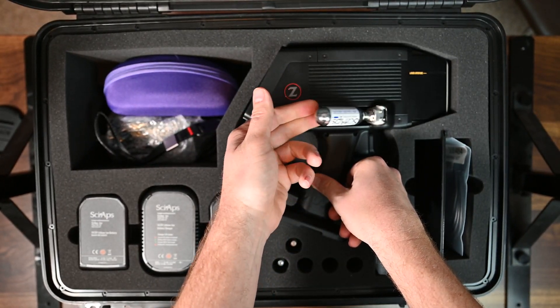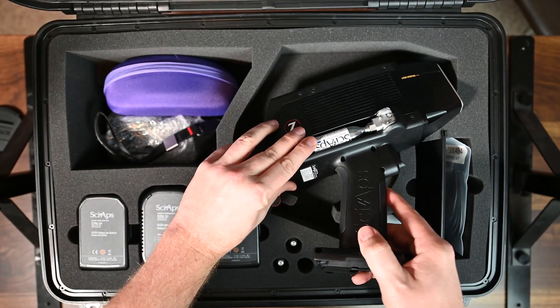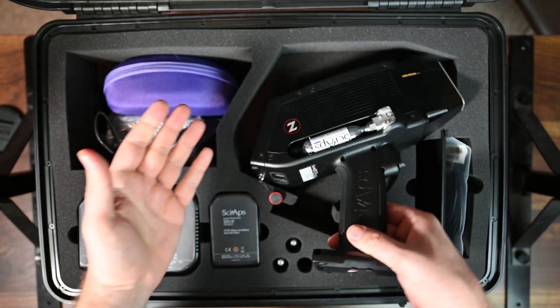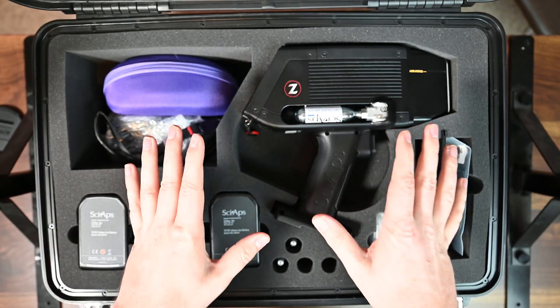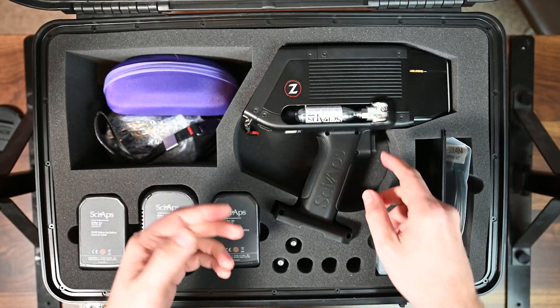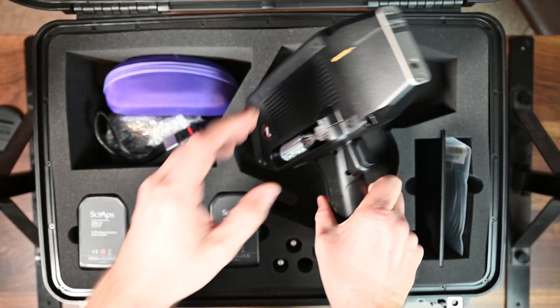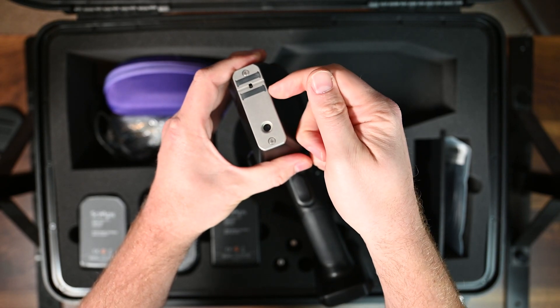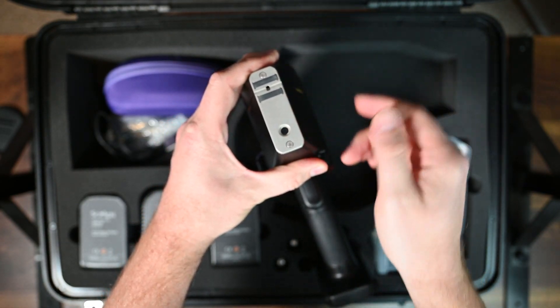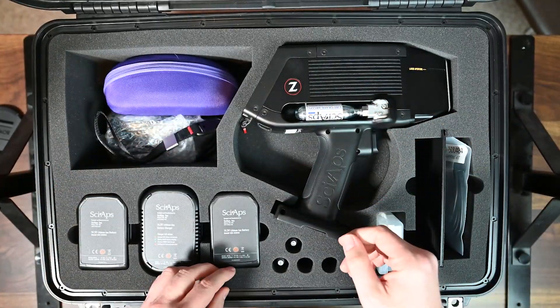When you're going to replace the argon canister, you just pull the argon out like this — you can see how that swings out of the unit — and it clips back in with a nice little click. I'm going to do a separate video about argon management for LIBS units. The gaskets in this fixture — there's actually a gasket behind the scenes under the faceplate — and those two gaskets are important to keep your argon sealed and keep your instrument running well.